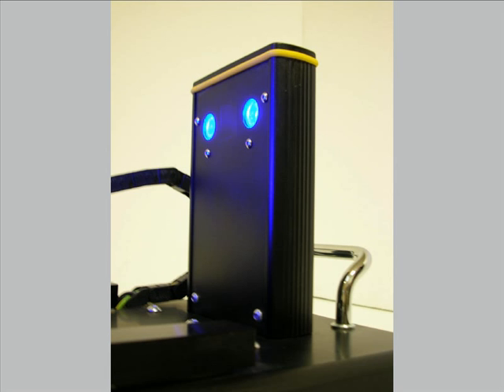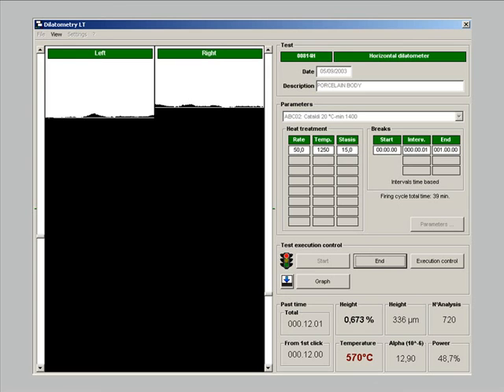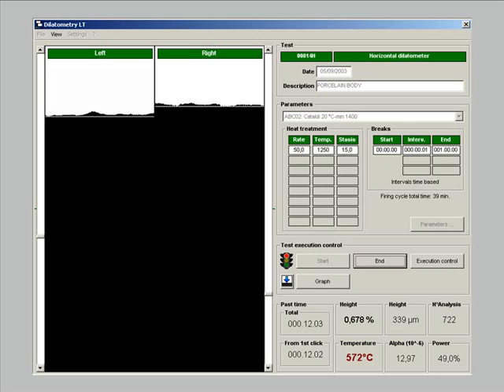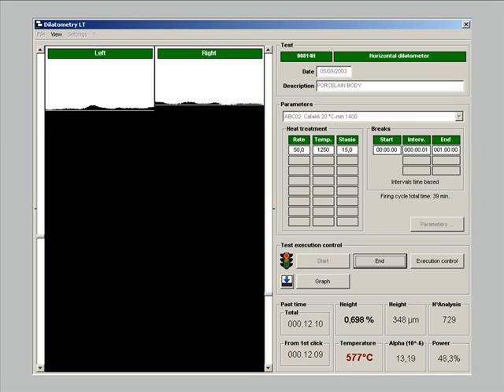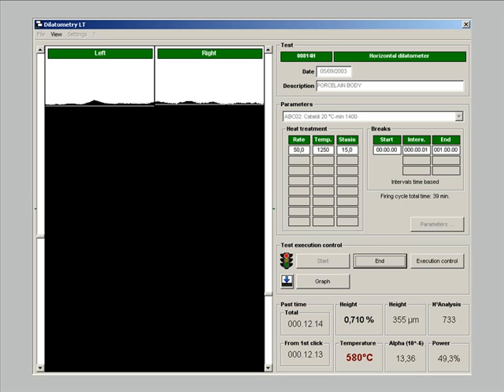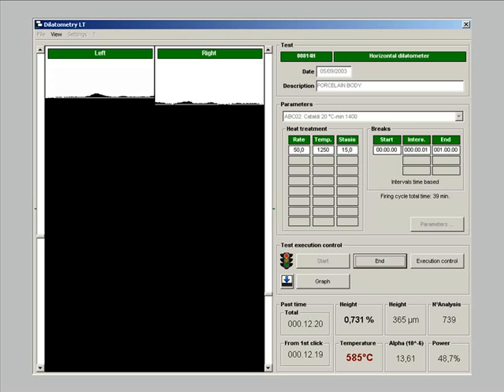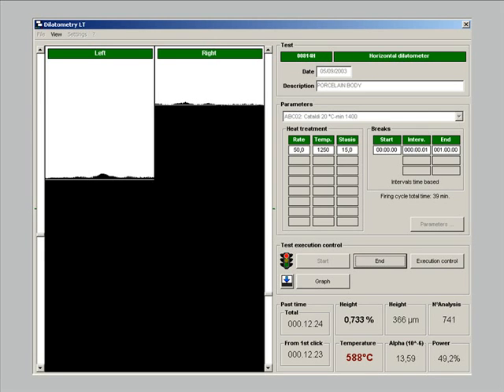The two ends of the sample are lighted by two beams of blue light with a wavelength of 478 nanometers. This light with a very short wavelength enables to reach the optical resolution of 0.5 microns per each pixel. This is the measuring window of the software where we can see on the left the images of the two ends of the sample. The measurement is carried out with no contact and with no interference caused by the measuring system. The sample is completely free and it expands or contracts with no constraints.